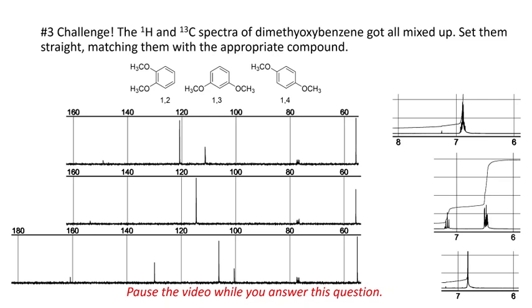Okay, well, this is a really interesting problem, I think, and a little bit challenging because we have the dissociation of the C13 and the proton, so we're going to have to do those independently. The other thing we have here that you can see is a significant amount of noise in the C13 spectrum, and this is part of the lesson on this. One of the problems in C13 is that because C13 is only 1.1% natural abundance, signals are much weaker, and it takes more scans, and sometimes we don't take as many scans as we wished, and the signals are not much higher than the noise. So again, we're just going to ignore these deuterochloroform signals and look at the others.